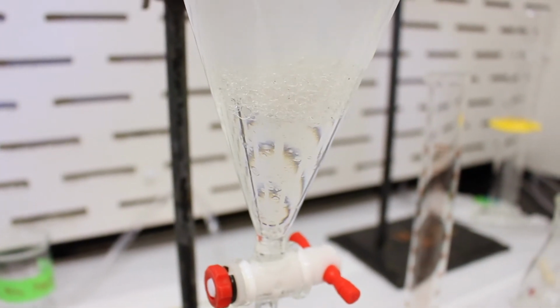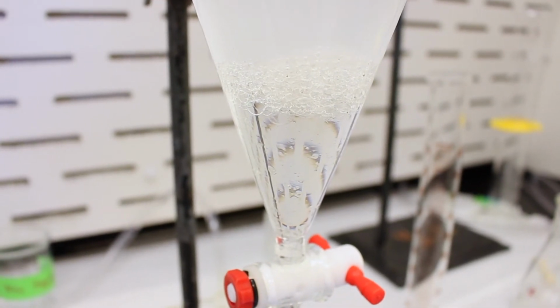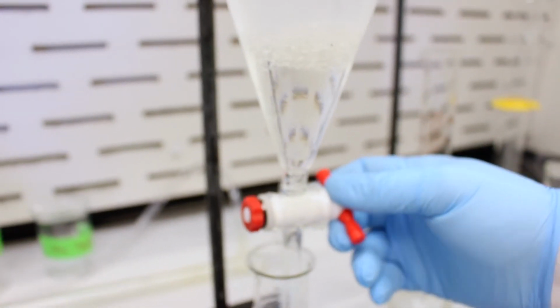Alright, so we've waited a few minutes, and as you can see, the emulsion sort of resolved itself with a little more coaxing. So we can drain our second DCM extract into our collection flask.